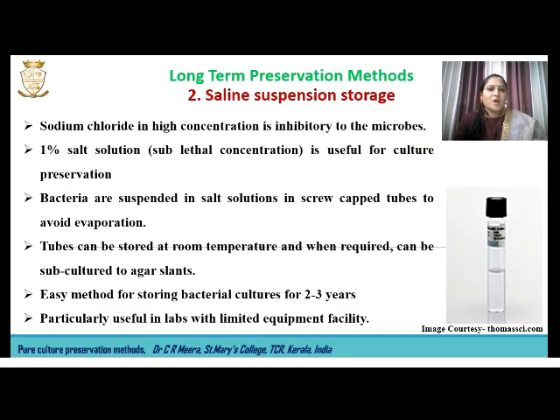The next long-term preservation method is saline suspension storage. This is a very simple and economical method. We all know sodium chloride in high concentration is inhibitory to microorganisms. So in this method, we make use of a sublethal concentration of sodium chloride. That is, a 1% salt solution is prepared here for the preservation of culture.